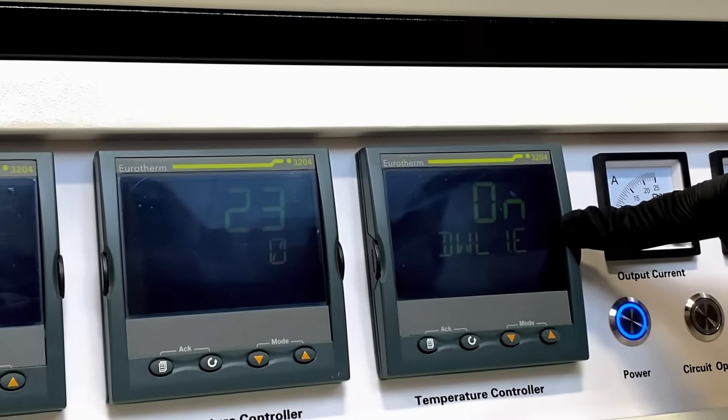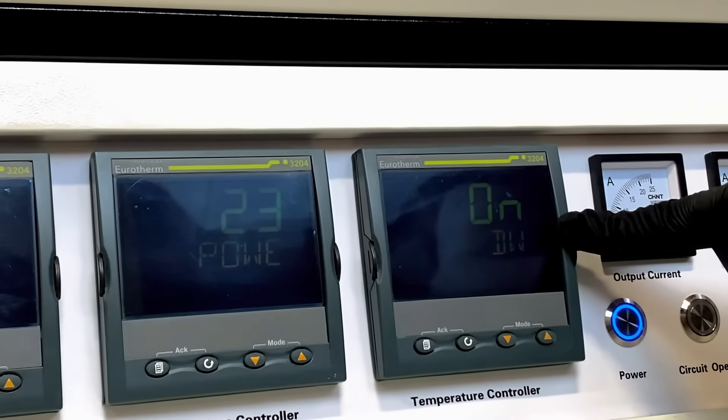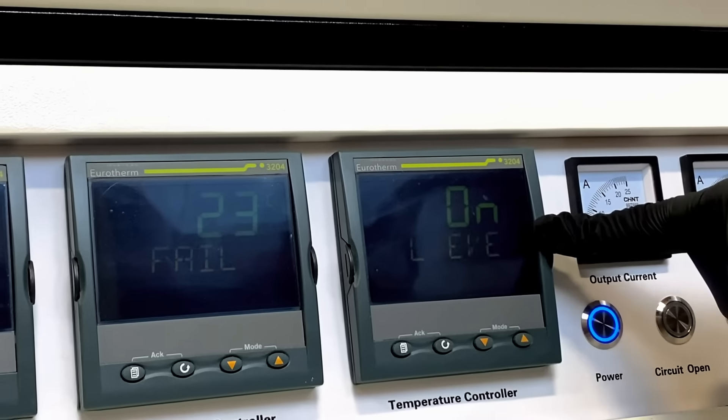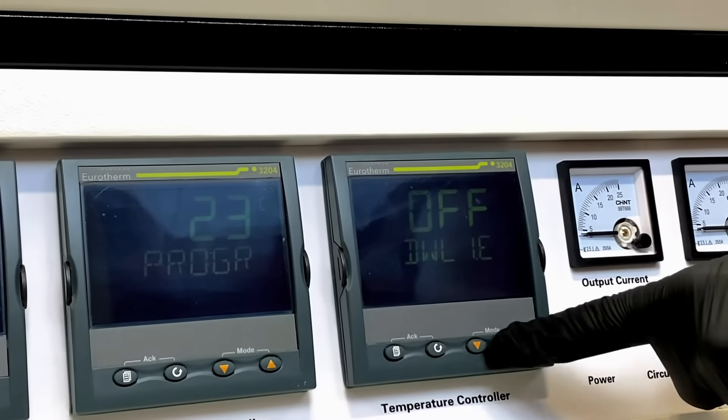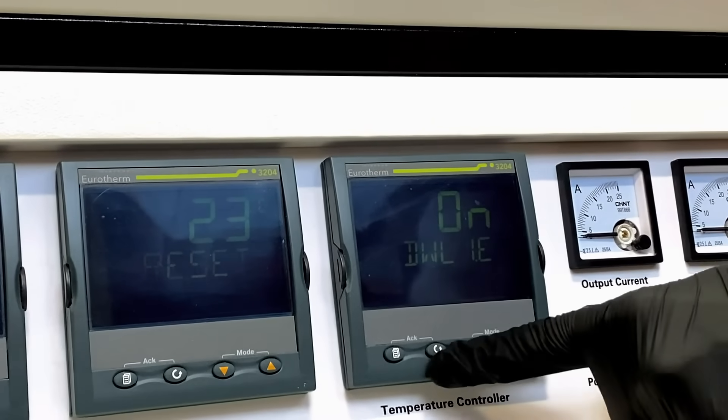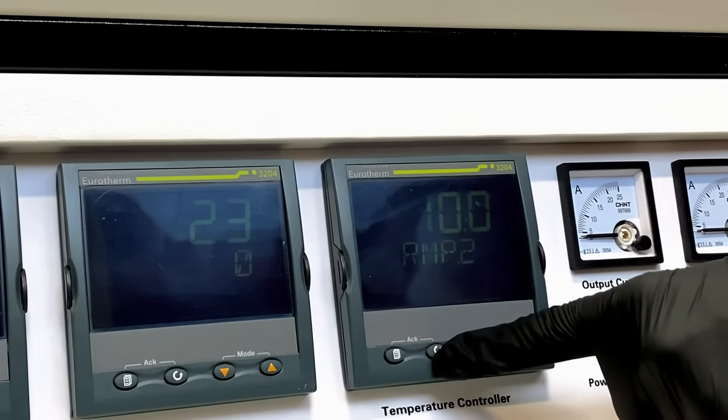This is to turn our dwell cycle on. If we did not want to maintain temperature for the set amount of time during the dwell cycle, we can turn this off. Press the cycle button again to accept.